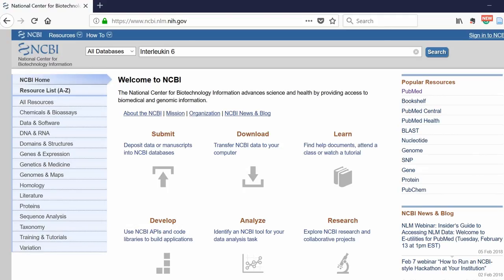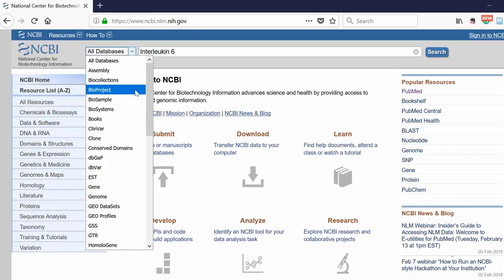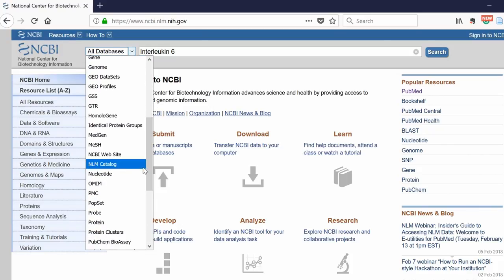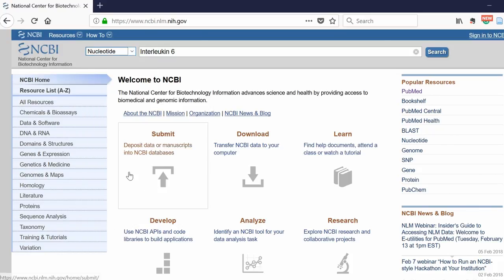I'm just going to search interleukin-6. Then on the drop-down menu, you want to select nucleotide. This is the part of the website we want to search. And you hit the search button.